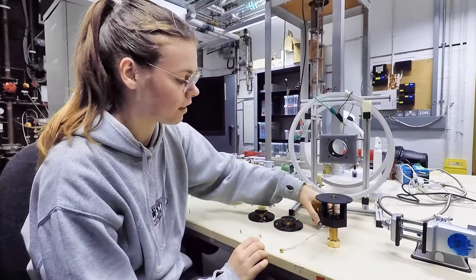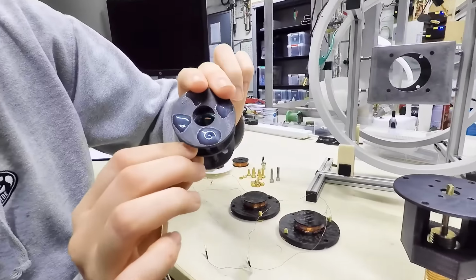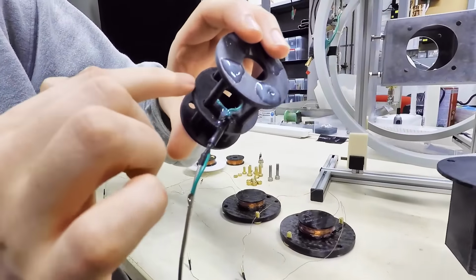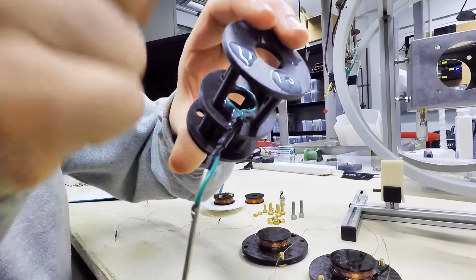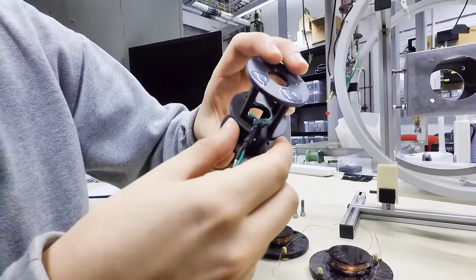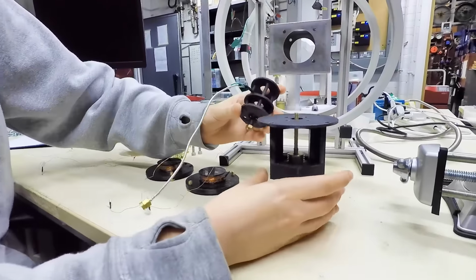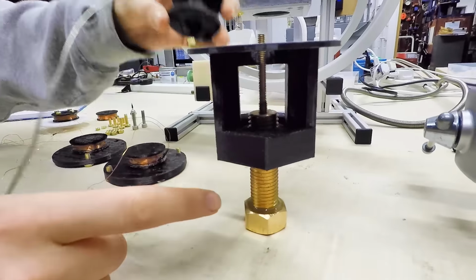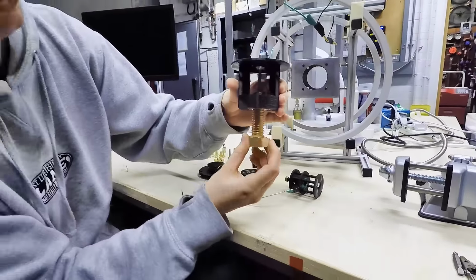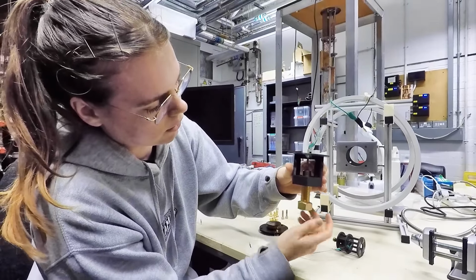And then the main component inside is the coupling loop, which we have on this moving setup. So this couples to the resonator around your sample. So you put the sample inside, and then we can move the coupling loop to match the resonator and couple up to that. The way that we move that is using this, which is a differential screw. This attaches to the top of that, and then by moving the screw up and down, it will move the shaft up and down.